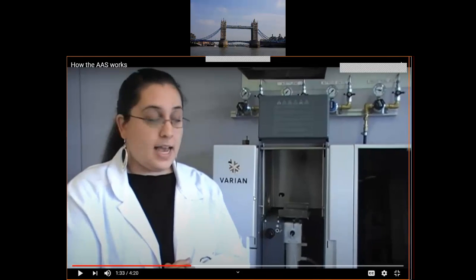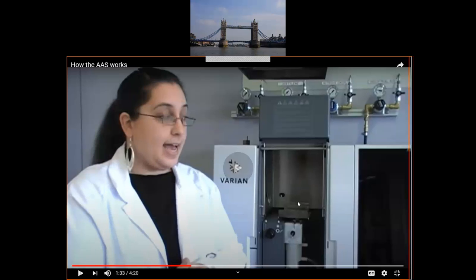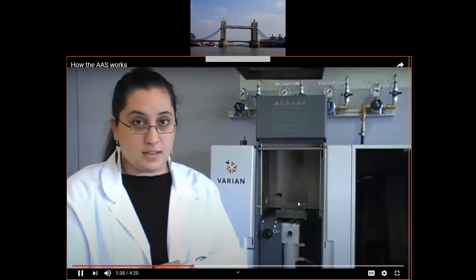fuel, with high temperatures over 1,000 degrees. Sweep means to carry, to sweep. It means the gas is used to carry our sample and then it will burn the sample. It will become the fuel source, the burning material. And above, depending on the mixture of gases that we use.